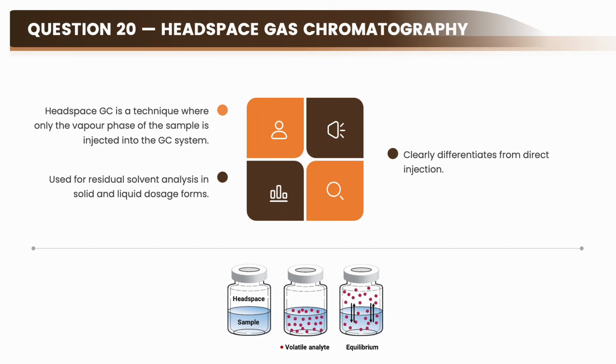And once we talk about the advanced GC applications, obviously the next question which will be fired towards you will be, what is headspace gas chromatography? Your answer should be like this.